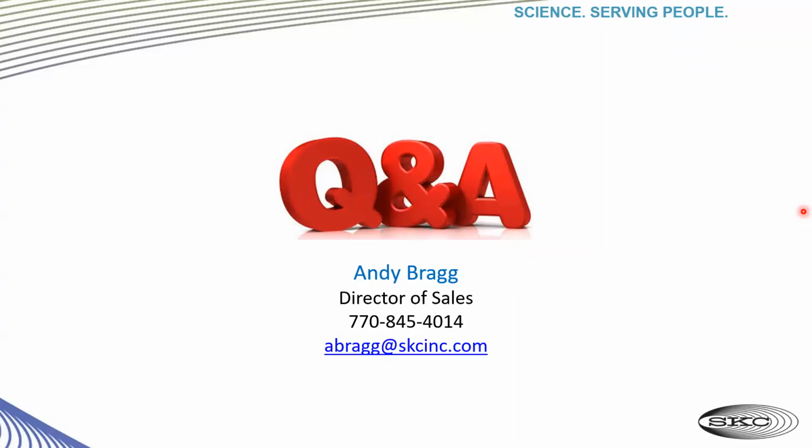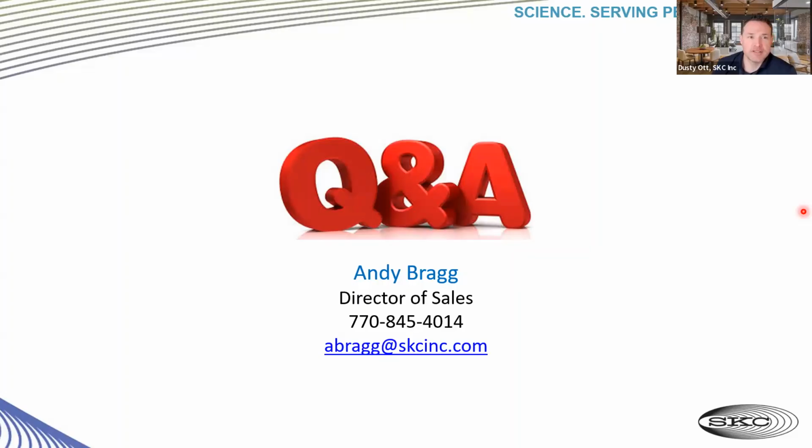Okay, great. The next question: have there been studies conducted on the collection efficiency in wet environments? Wow, that is a popular question. I think Dusty and Saulius have both probably been asked that question. Dusty, you want to address that from a CIH standpoint? Yeah, the question that we've had a lot is sampling with both PPIs and cyclones in wet environments where water is actively being used for cutting material, and that water is then sprayed onto the person being sampled and into the PPI or into the cyclone.